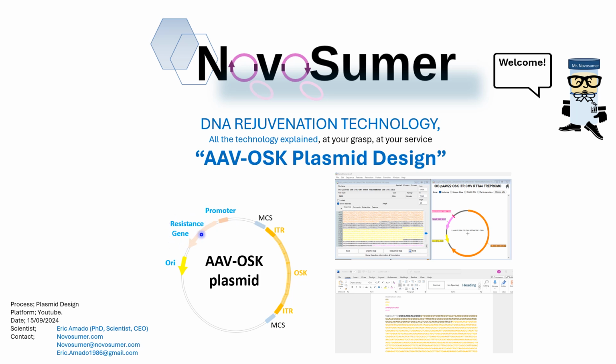You see here the promoter, the resistance gene, the ORI, and so on. And once we understand the different parts, what we are going to do is copy-paste one after another. And we are going to use text editors. As you can see here, we can use a text editor that is specific for DNA editing, as this one that is called Serial Cloner.